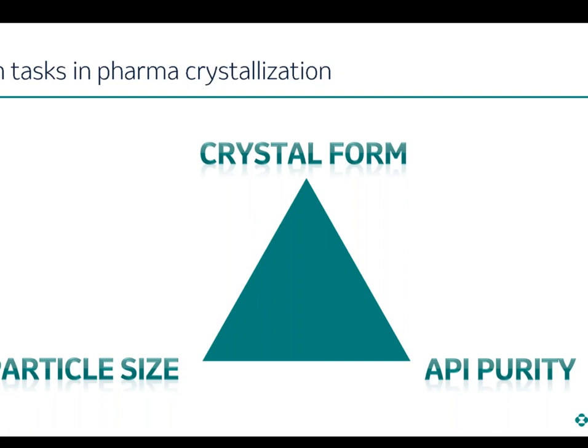One is to ensure the crystal form, typically the most stable crystal form, to ensure shelf life, so that nothing changes inside the drug product. So it's a thermodynamically stable form.